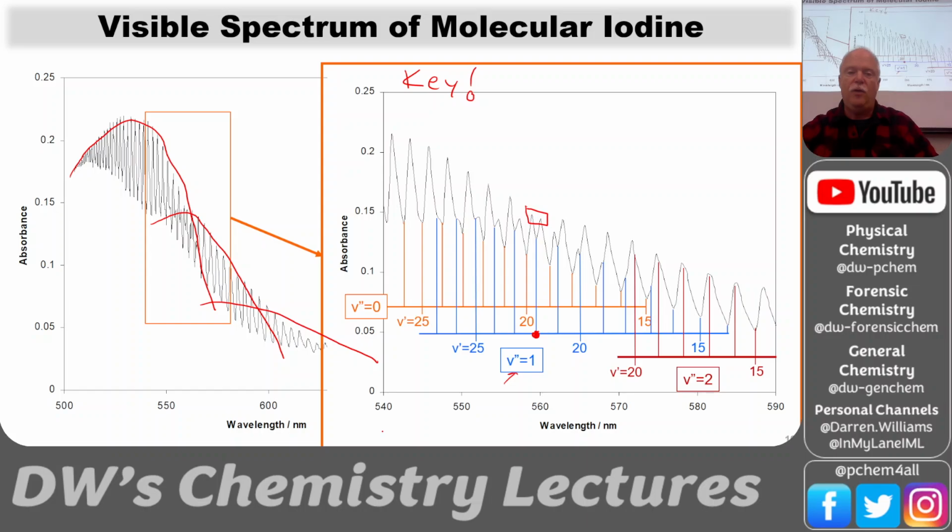Okay. What about the one just next to it? This one here. So to the left, or the short wavelength side of that double peak, is right here. So the V prime column is 20 and the V double prime column is 0. So all of those orange ones are starting at 0, the ground vibrational state and the ground electronic state, and going to V prime, in this case 15, 16, 17, 18, 19, 20, 21, and so on. It's hitting all of those up there in the top. And all of these are different by that electronic energy difference that gets us over here into the visible region.